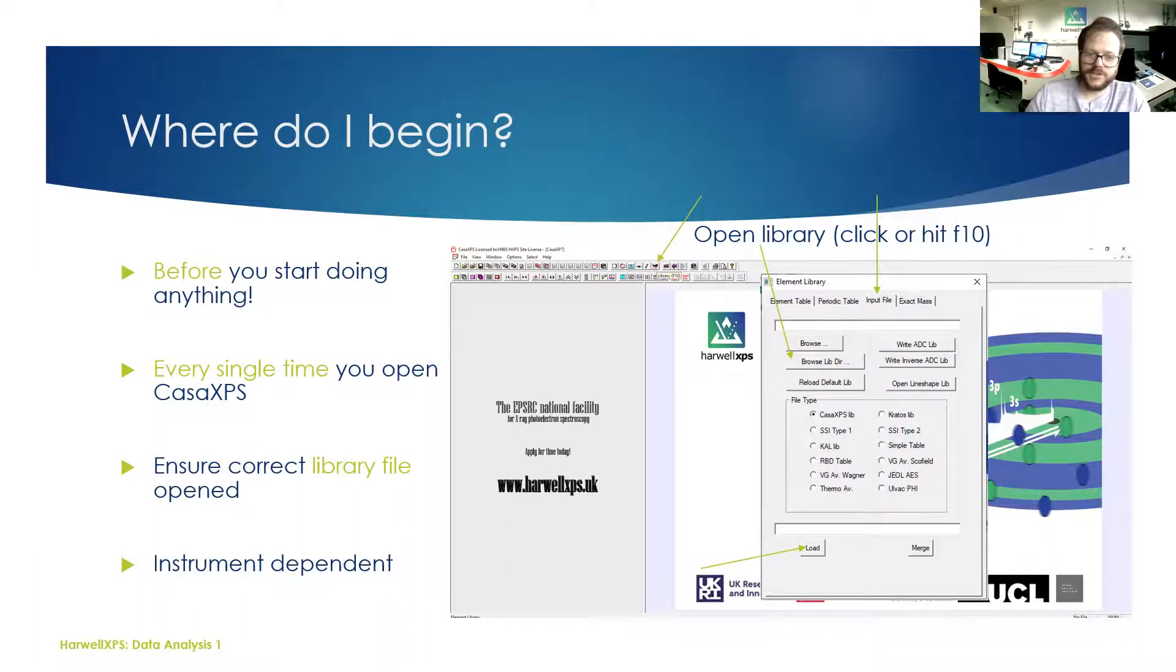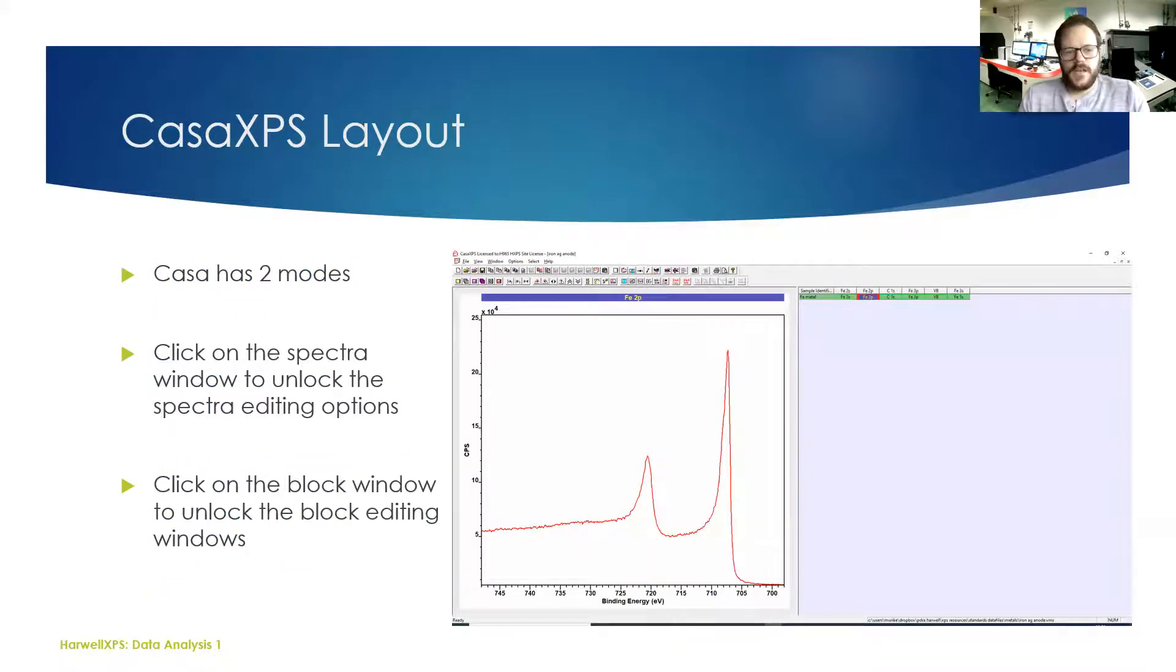A quick word on just the general layout of Casa. It's got two modes of operation, and depending on where you click on the main screen, that will change the mode of operation. If you click anywhere on the spectra, that opens up all of these options here. Then some of those to the right are grayed out, whereas if you click on this side on the right-hand side, you will then make those options available and the ones to the left will be grayed out.